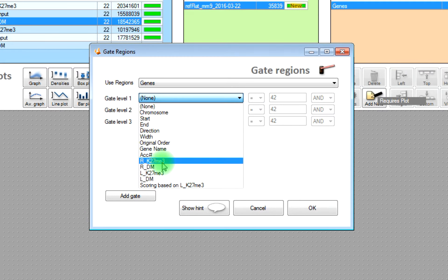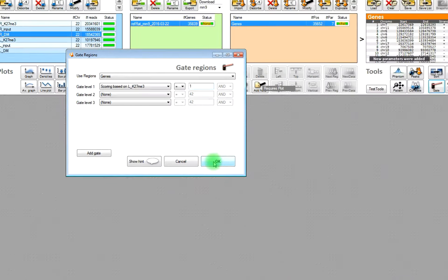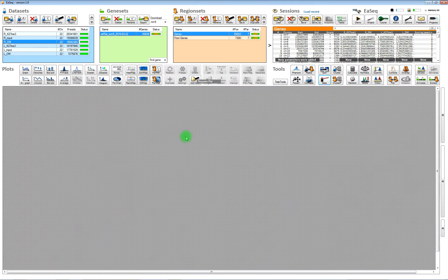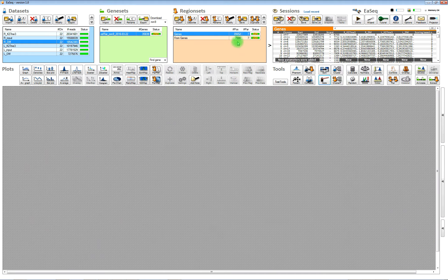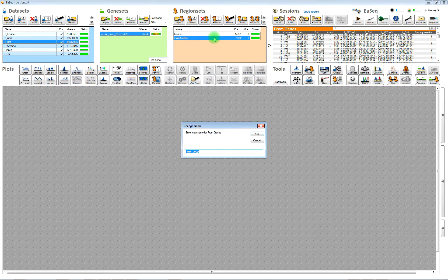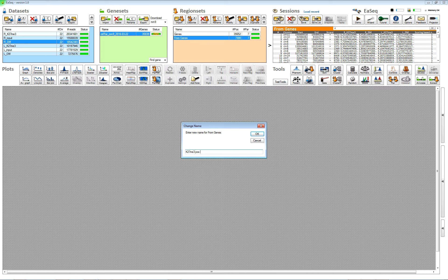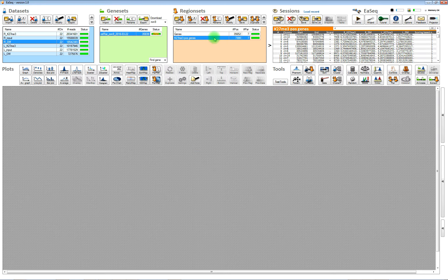And once we have this new column, then we can gate out the regions with a high level. We simply choose a value of 1, then we will get 7300 regions that have a high level of this mark. We can rename them by double clicking on the region set.